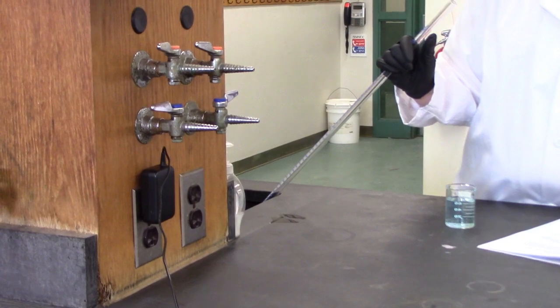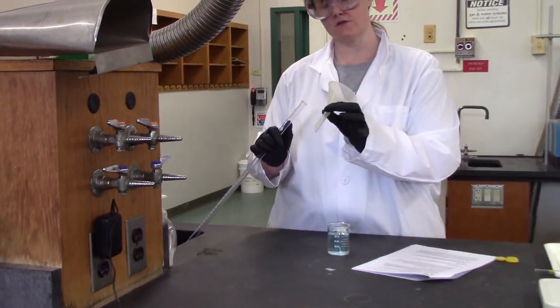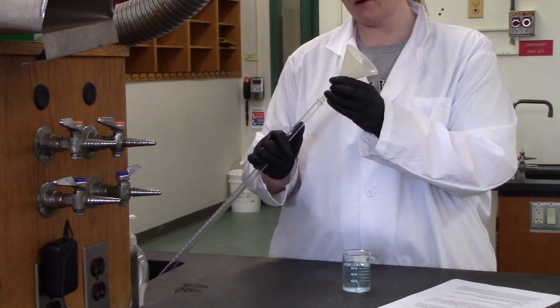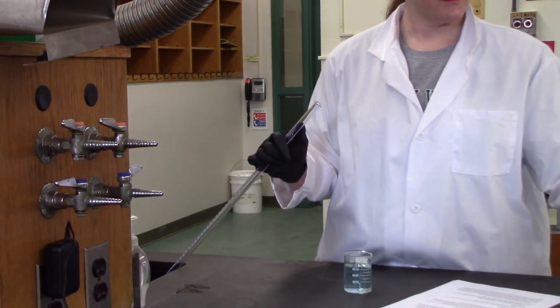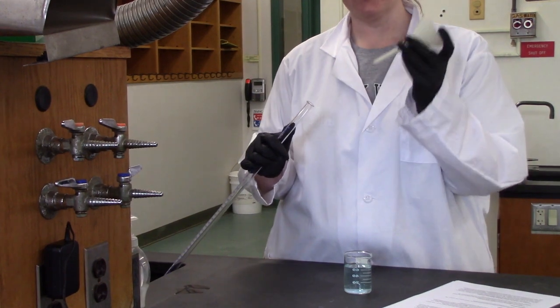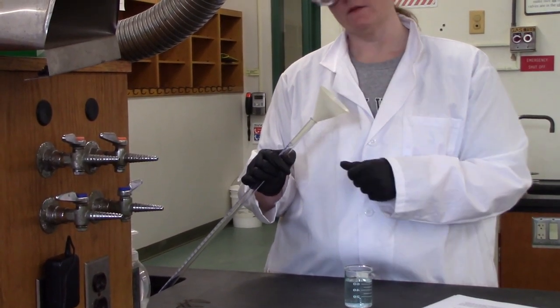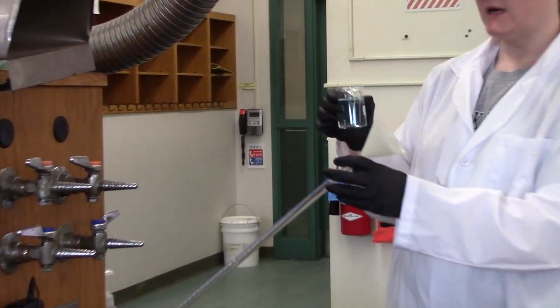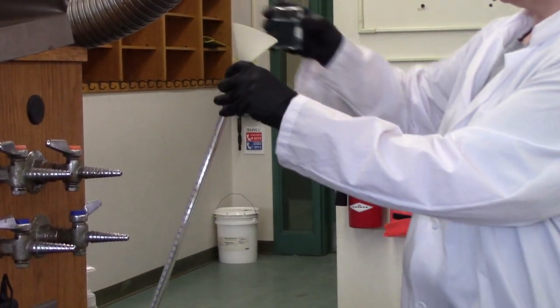And then I'm going to use a funnel. These are in your drawer, but sometimes the ones in the drawer are the larger stemmed funnel, which is handy for filtering. But here, they're not going to fit well inside of your buret. So on the side bench in our labs, we have a drawer that's marked funnel, and you can go look for one with a thinner stem. That will sit right in there, okay? And so basically, what you're going to do is take your sodium hydroxide, the 0.1 molar that's already prepared for you, and you're just going to pour it in and rinse.